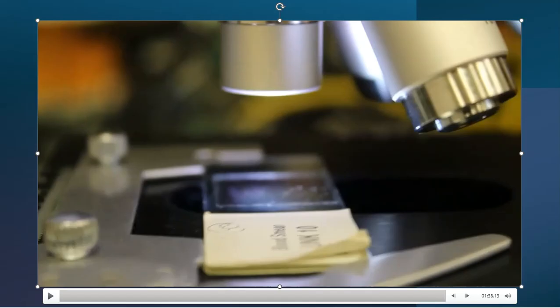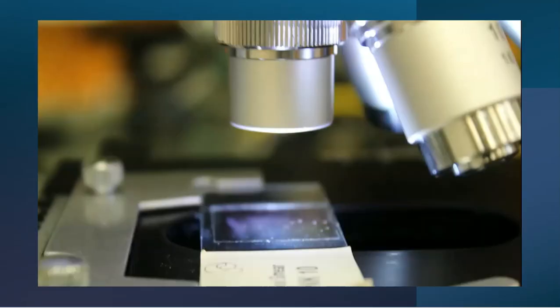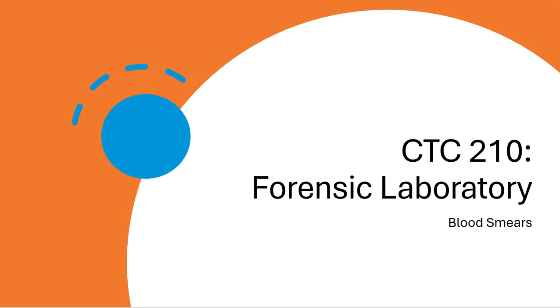All right, guys, so I wanted to end it up on that video because I think it's very important for me to tell you again to not break the slides. Again, I should give you an automatic F if you are one of those people that take the lens and crash it against the slide and damage it so no one else can use it. I'm sure that everybody else in the class will be like, woohoo, yay, they broke it, I don't have to read it. And then you're going to be boo-hoo in the corner because you're going to get the F.